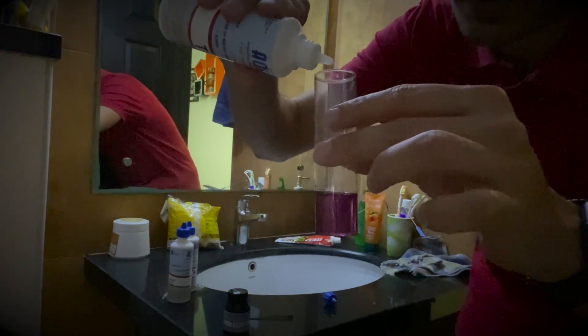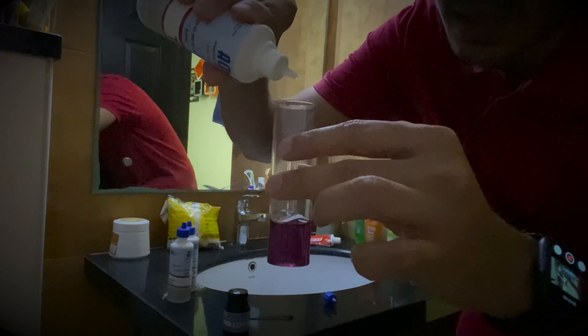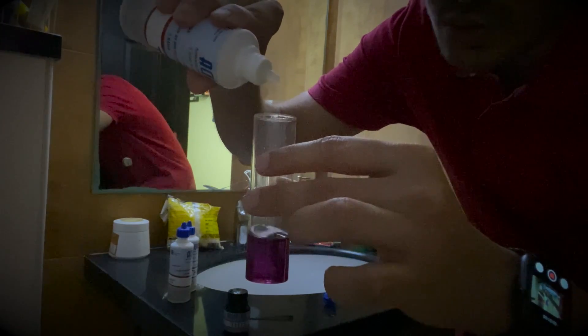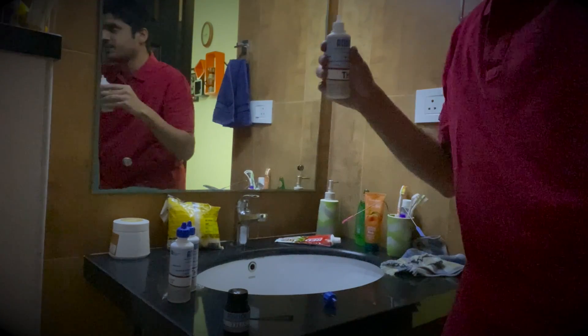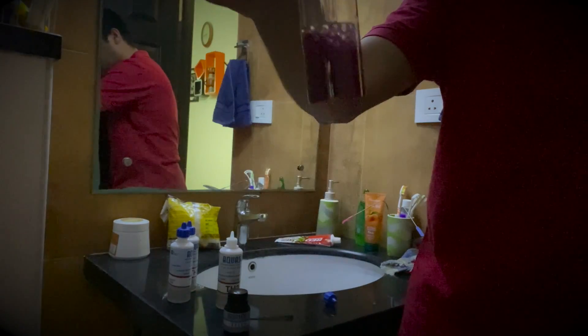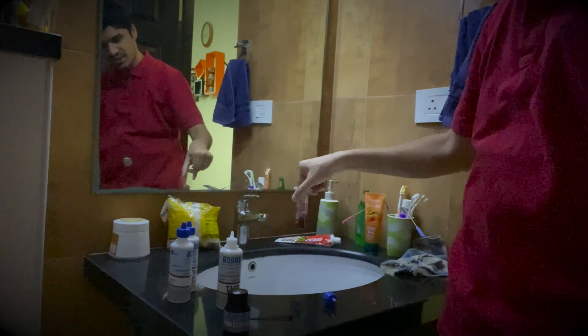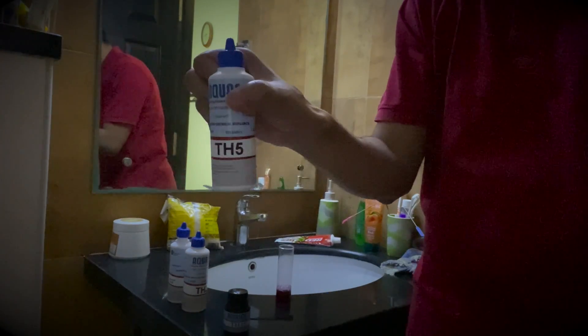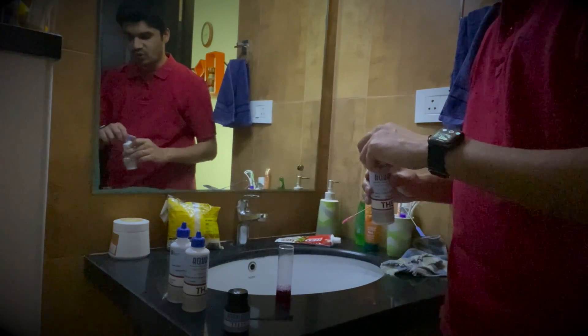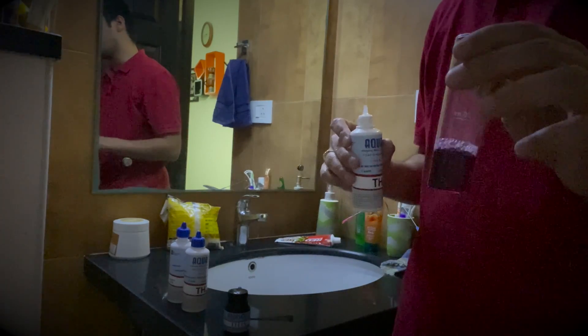The color is purple right now. I'm going to put about 12 drops — 1, 2, 3, 4, 5, 6, 7, 8, 9, 10, 11, and 12. Mix that well. You can see the color has changed to a shade of red. Start entering TH5 drops one by one, and depending on the number of drops it takes for the water to turn blue, we multiply that by 25 to get the total hardness in the water.